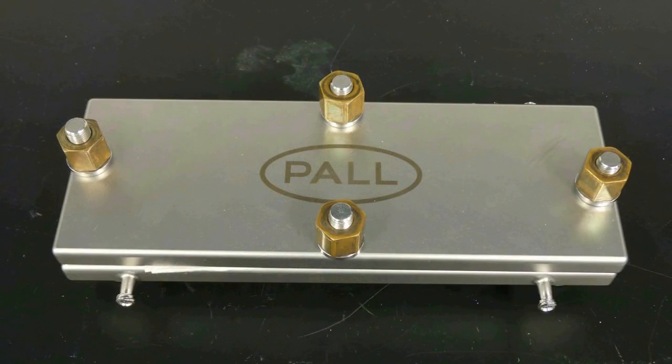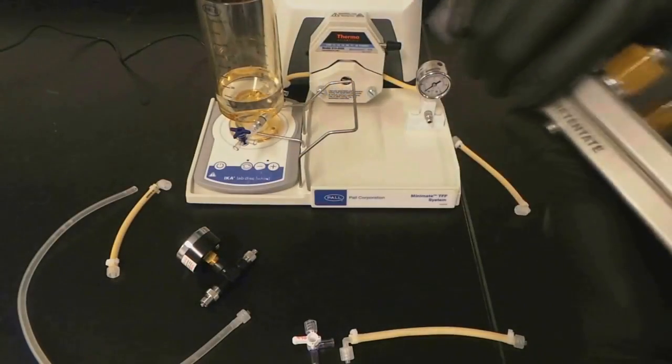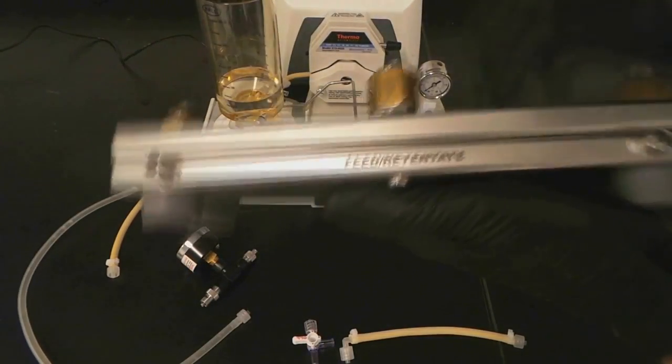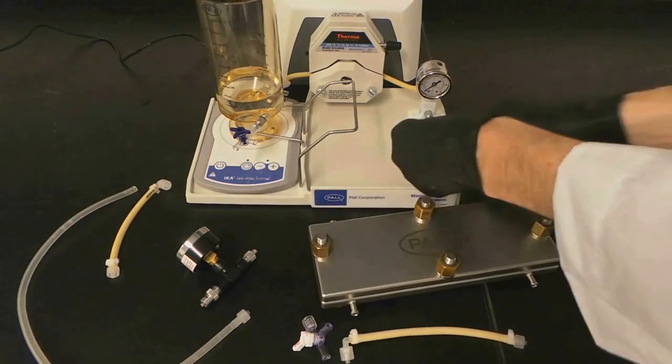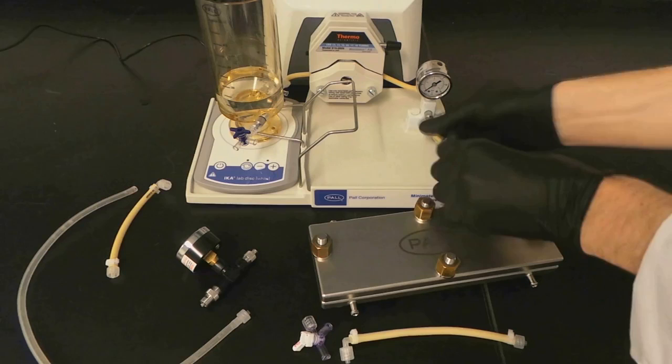The LV Centramate holder can also be used with the Minimate system. You will need more tubing along with another pressure gauge. Start by attaching a tube from the Minimate pressure gauge to the LV Centramate feed retentate inlet.